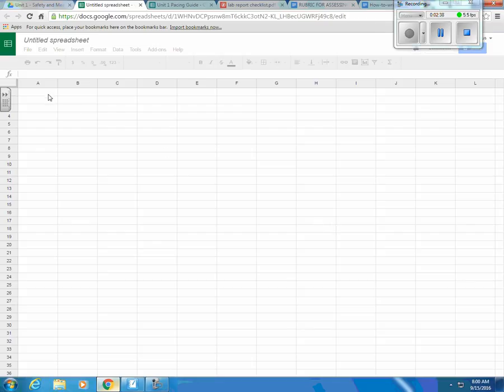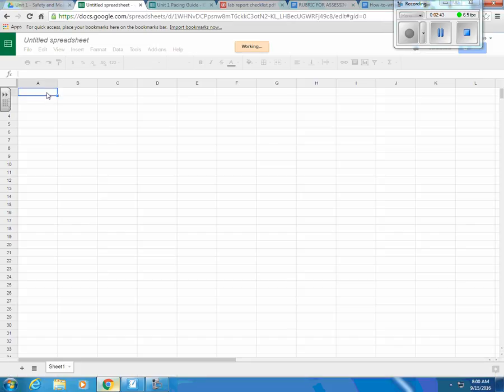It is important that you fill it in exactly as I'm showing you, so you won't have any issues with your graph. The first thing is going to be the liquid, and then we've got our mass, then our volume, then our percent sugar, and then our density. Don't change any of these, just fill it in like this.